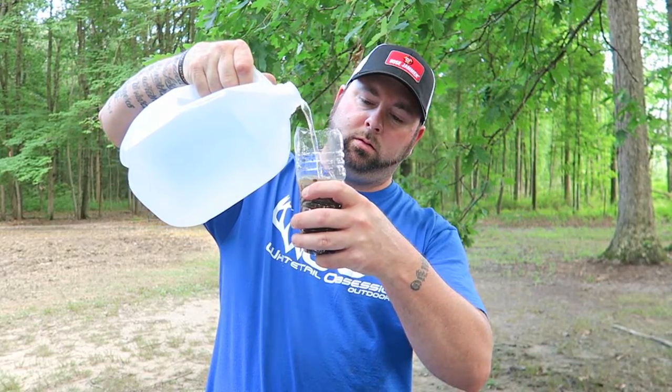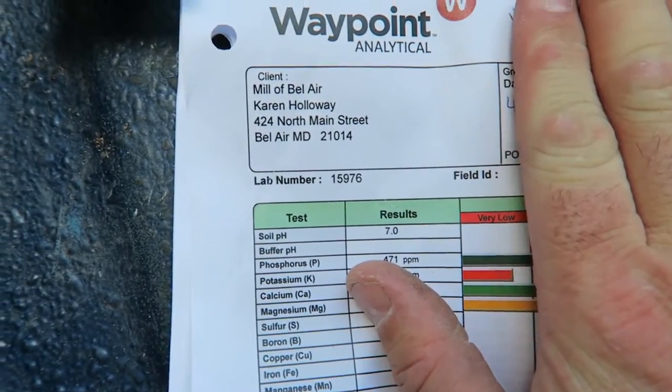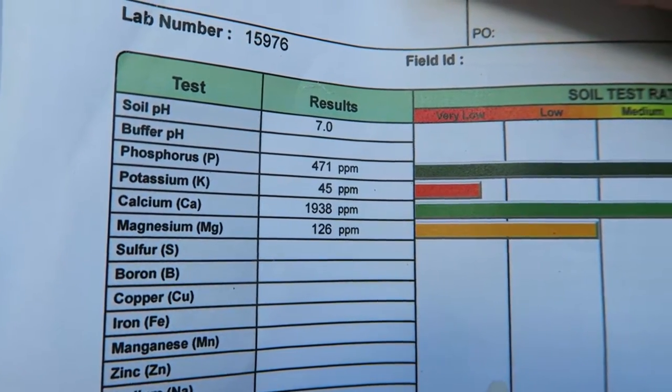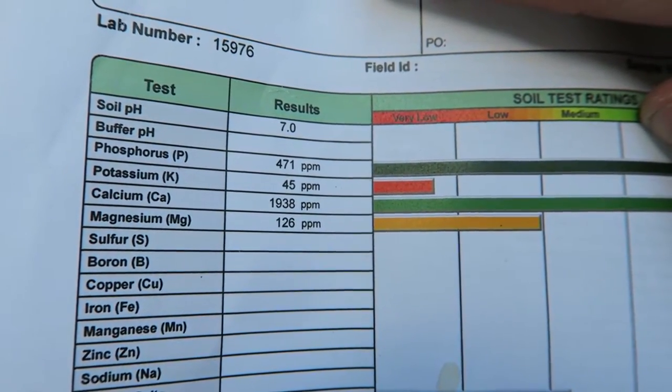We went ahead and added roughly six to eight ounces of dirt into the cup, then added an equal part of distilled water, mixed it up into a little mud pie, and now we let the dirt settle to the bottom — roughly 15 minutes. Also, you can see here this plot was tested by Waypoint: soil pH was 7.0, potassium was low, and magnesium was low, but we went ahead and corrected that with some fertilizer. Right now we're just worried about the pH.